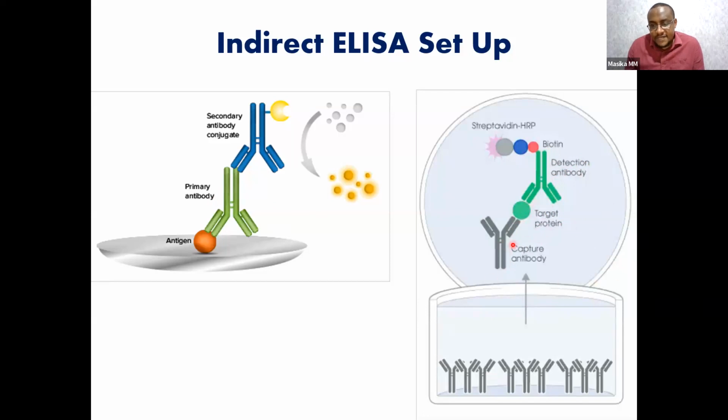It is difficult for two antibodies to bind to one protein non-specifically, meaning binding to another antigen which is not the target. So in this case, you have two opportunities to check specificity. And so this is more likely to have very good specificity, to be specific to the particular target. And then, of course, there's a detection mechanism with this conjugated detection antibody reacting with a substrate. So really, that is the simple end of it. You have antibodies and antigens interacting, and you have a way of detecting that interaction.